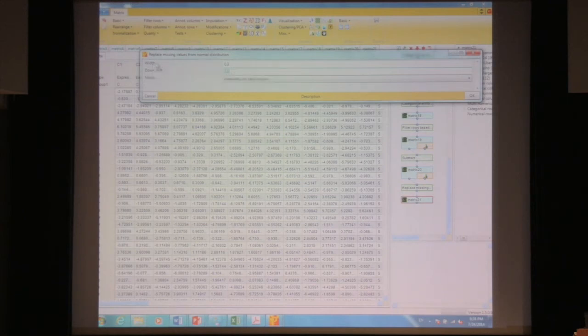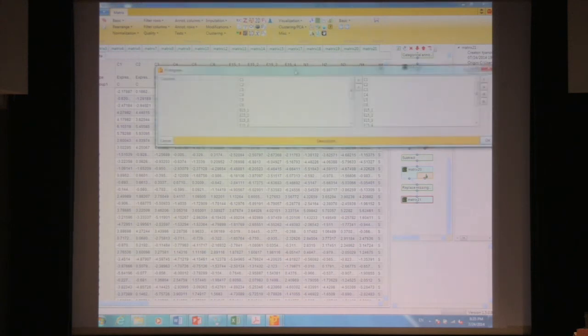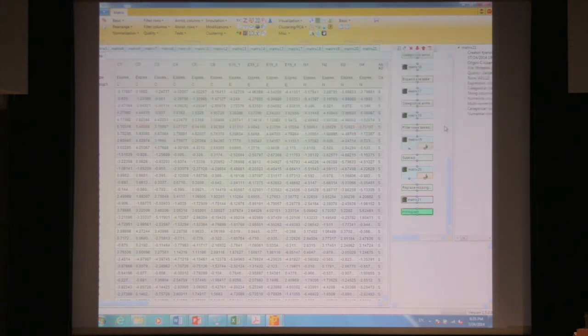I'll show you with the histogram. But basically, I don't think there's a logical way to choose those values. You just try larger ones and smaller ones and see what works best. But if I plot a histogram, I'll be able to show you what the downshift means.